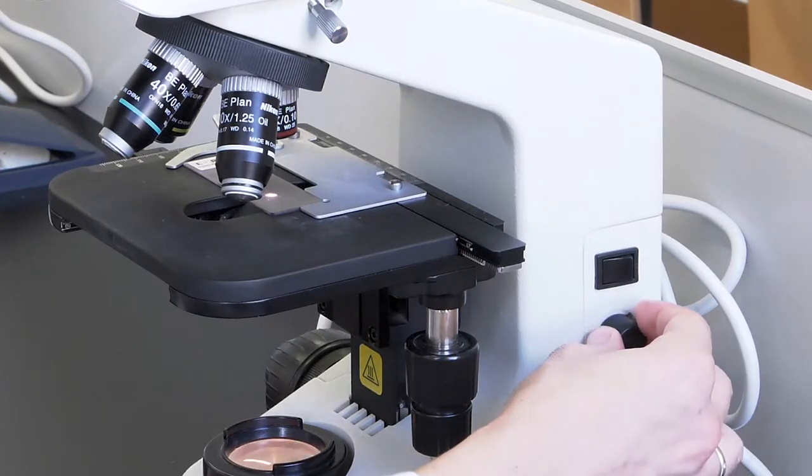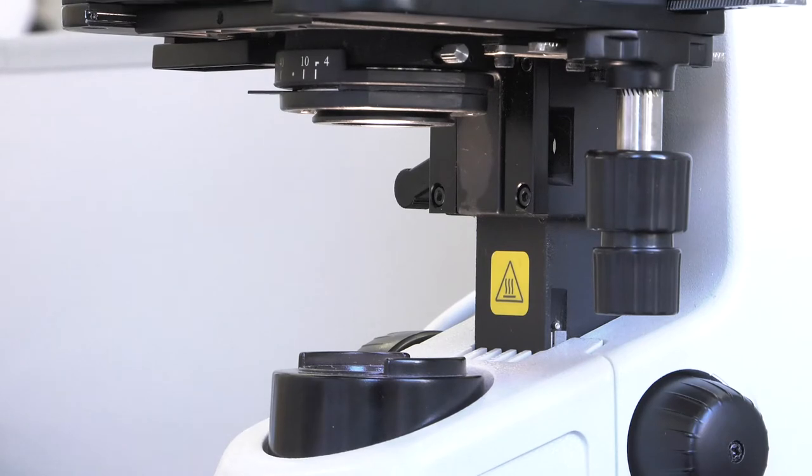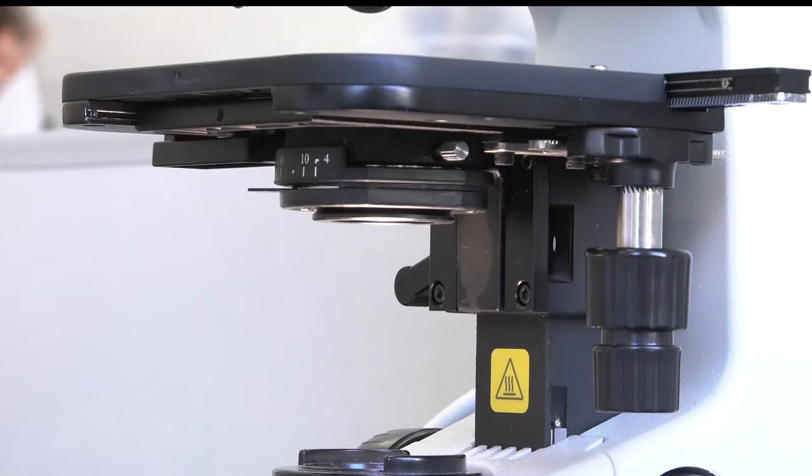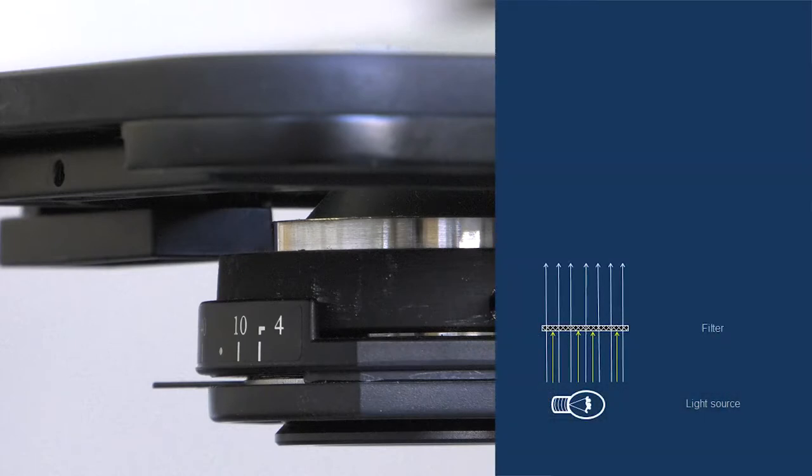However, before reaching the condenser lens, the light must pass through two elements. The first one is the light filter. The filter absorbs the excess of radiation from certain colors and improves the appearance of the projected image.